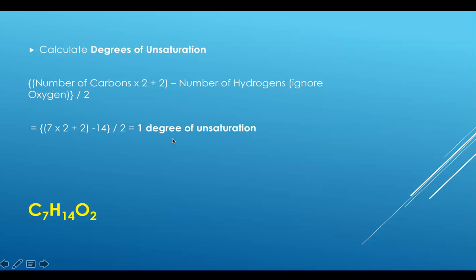And so what this tells us is that we are going to look for one double bond in this molecule, one degree of unsaturation.